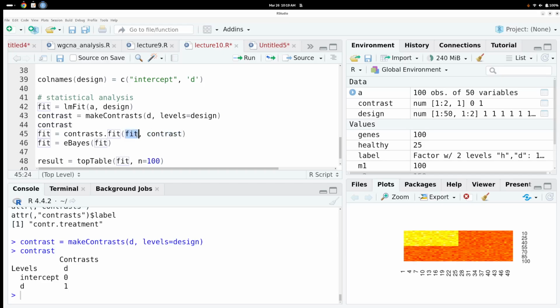So notice that here we override this fit object by this analysis because here we exactly study whether the null hypothesis, as I described it earlier, holds or not. So after this function, we don't care any longer about the inference of alpha and beta.